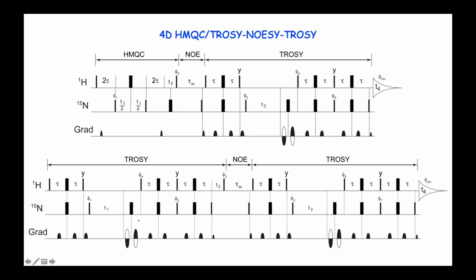Okay, so when I ran this, it was like an adventure because I couldn't get the data correctly, particularly in TopSpin. Whenever I run a multi-dimensional experiment, I always test the plane.